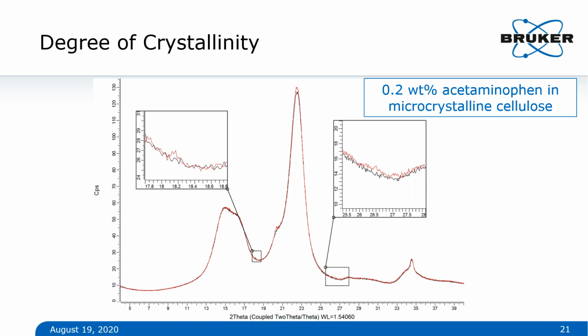So, a somewhat rambling answer to come back to that: by spinning your sample, you can effectively increase your statistics by making it look like you have more average orientations of your crystal, right? So when you count longer, what you're doing while you're spinning is you're able to get more of these averaging times in there.